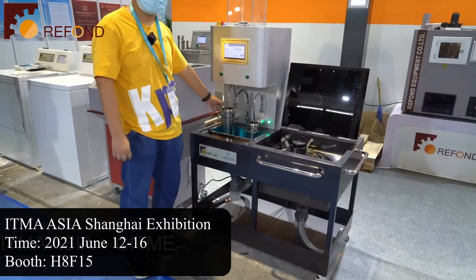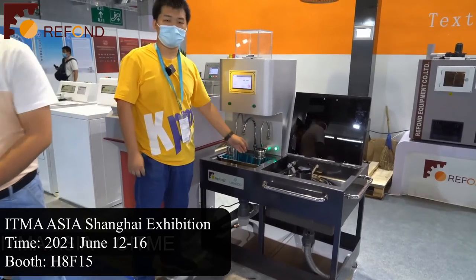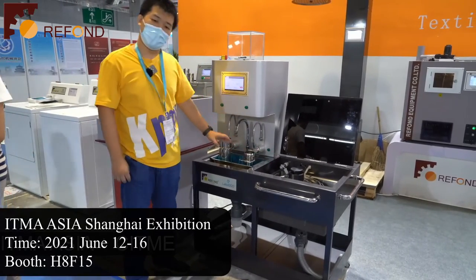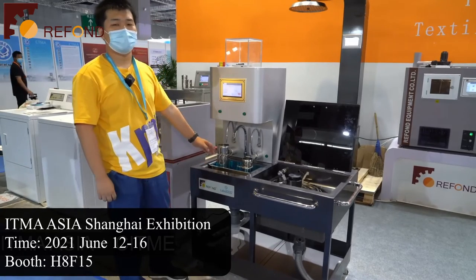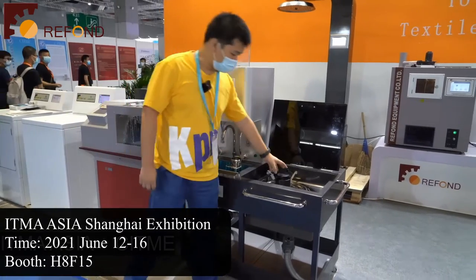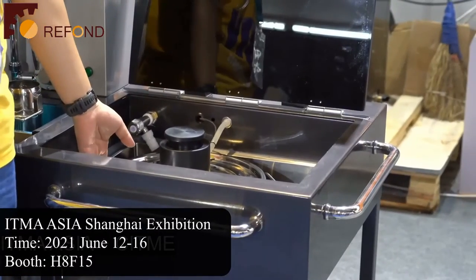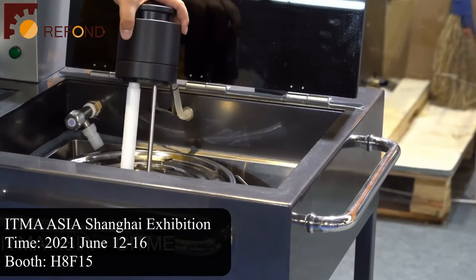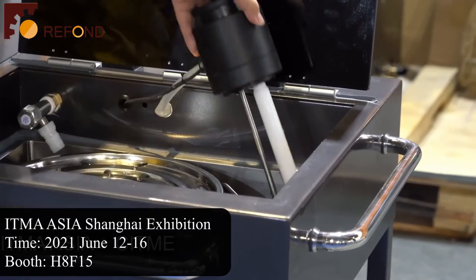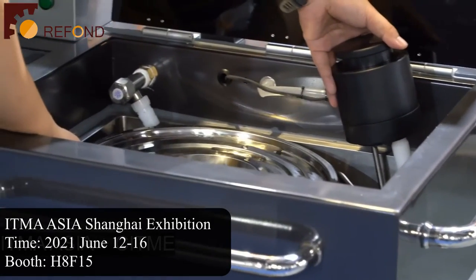But now with our Labo DDD, you can save a lot of labor and save a lot of time, while at the same time still maintaining very high precision and very high repeatability. You can easily change the detergent on the right side by just taking out the pumping probe and then removing the detergent container inside.